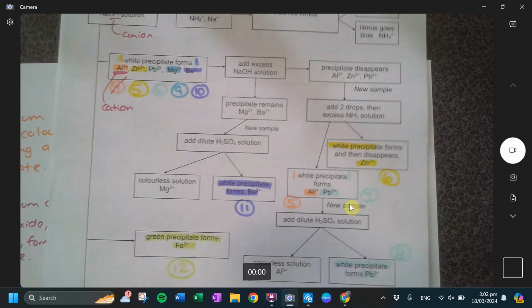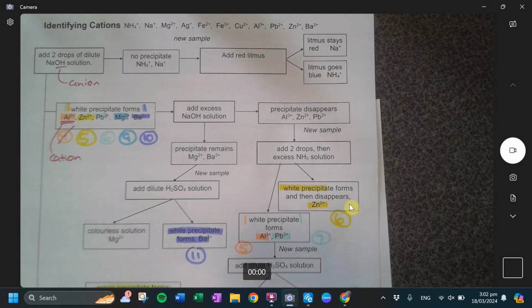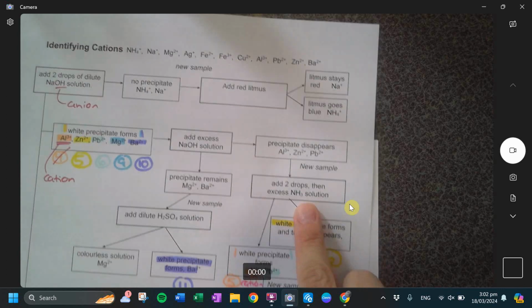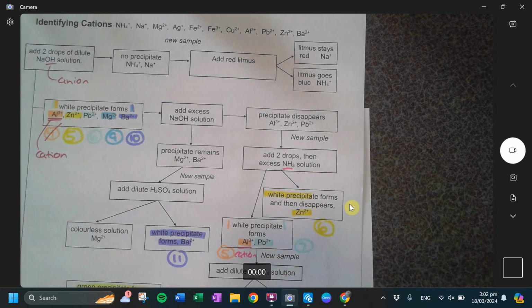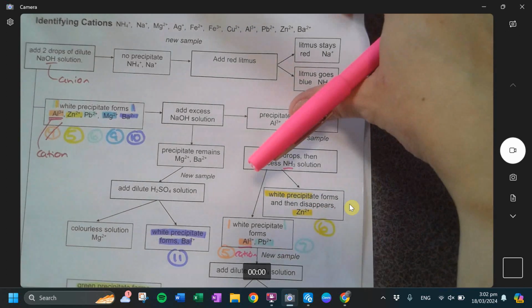All right. Reaction number 5. We had a white precipitate. The cation, again, is aluminium. Now, here's the challenge. We look above, and we see that we've added ammonia to it, NH3. So then we're like, what is our anion? Challenging challenge. All right, so let me explain what's happening.